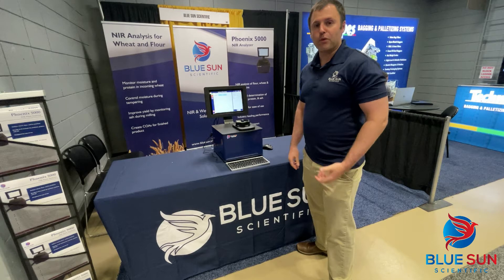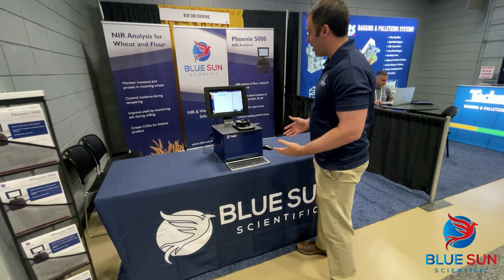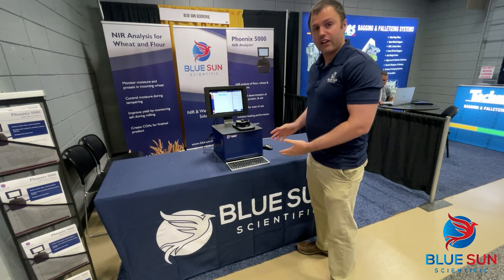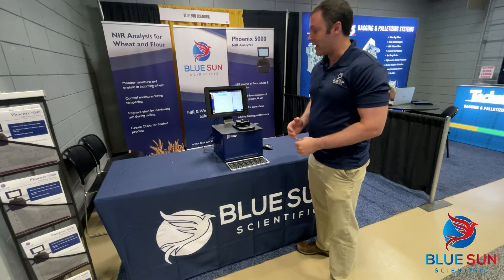We are here at IOM's 125th anniversary in Little Rock, Arkansas. We're showcasing our latest and greatest NIR instrument. This is the Phoenix 5000. It's an NIR instrument that's ideal for wheat and whole grain analysis.